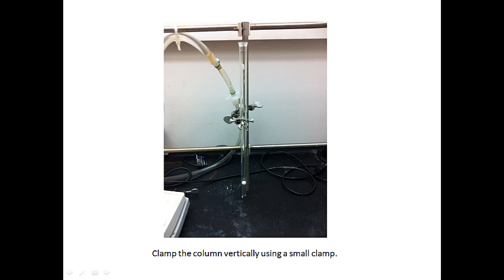Then you're going to clamp the column, the small column here, vertically in your hood. And this column is probably 1 or 2 foot long. It has, again, this small glass frit at the bottom, so solution will come through the column. There's no way to stop that, so you have to make sure that something down here is available to catch the solution, and then you're going to place everything through the top.